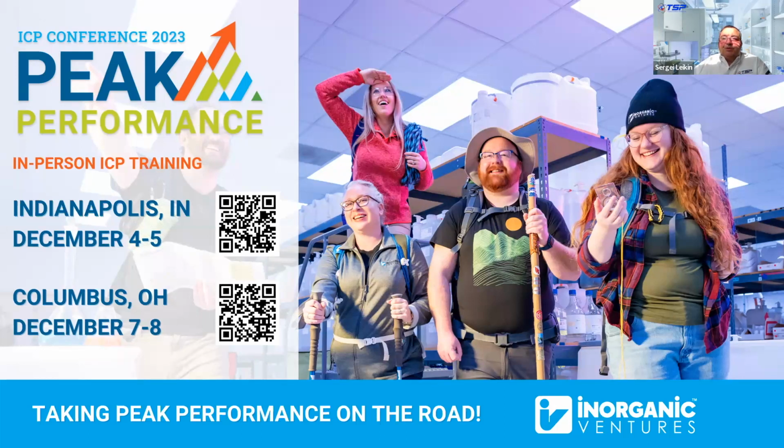The other thing depends on the volatility of your organic matrix. If it's too volatile, it overloads your plasma, and you may run into problems, even shutting it down. So in order to deal with that, you can do two things. Number one, decrease the nebulizer flow to limit the amount of sample, also decrease the speed of your pump, and or put in tubing with a small ID when it really needs to be cut off, to reduce the sample amount going into your spray chamber and the plasma.